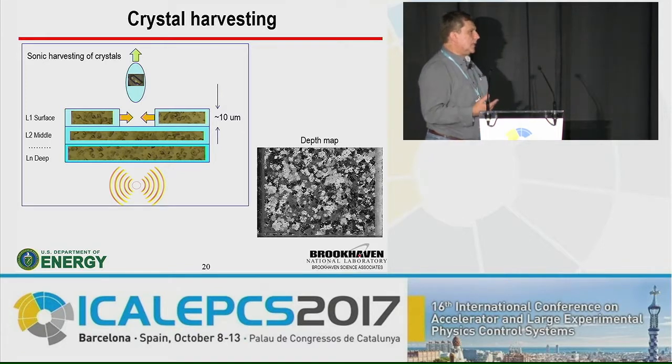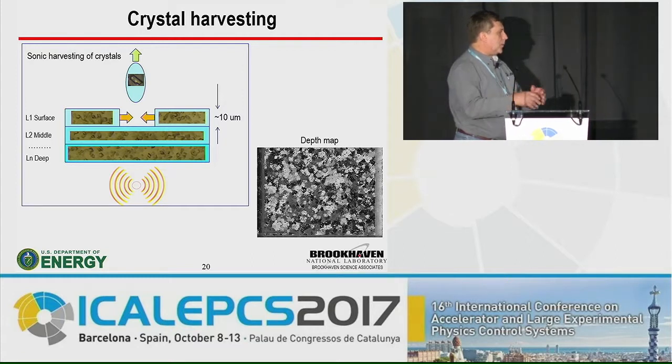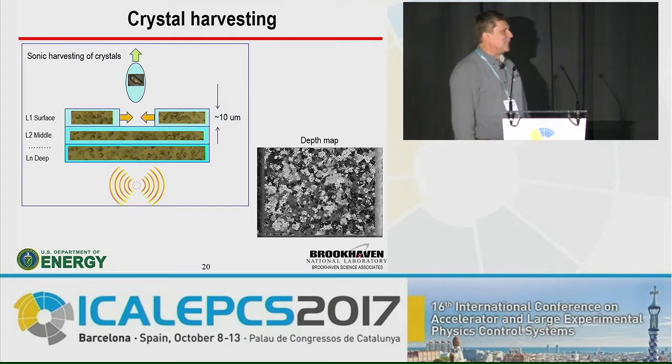What was really critical about the on-axis microscope is that we've seen, for example, bubbles coming out during data collection, and without having that instrument there, it would be very misleading to analyze the data. So radiation damage, you see. Well, it's heat, radiation, whatever is happening, but we've seen liquid in the crystals bubbling there, and that's not intended.